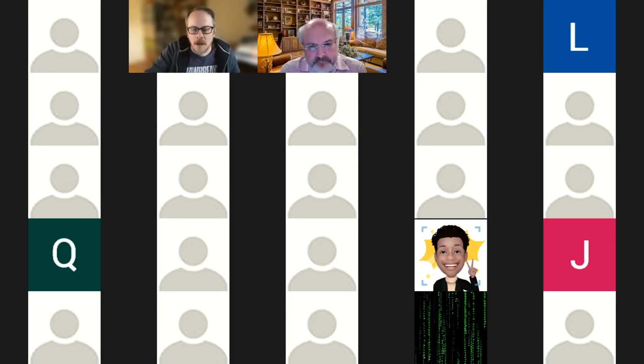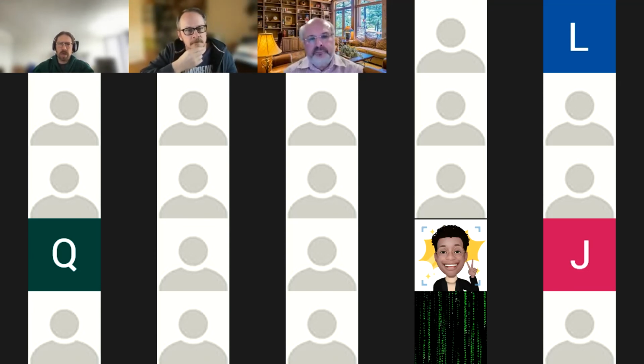Okay. We have a question from Pete. So go ahead, jump in, Pete. So actually, I have 2 questions, and the first one is kind of a 2-parter. Is it possible for somebody to start a project in CCP4 Cloud and just say, lock me to this version of CCP4 regardless of how long my project takes? And could somebody say, I have a project from a year ago, can I rerun that with the old version because I want to change what happened there?